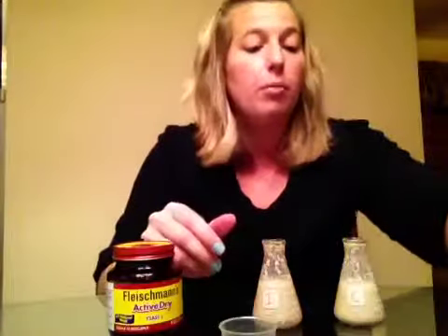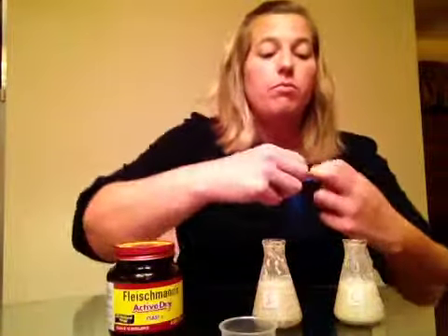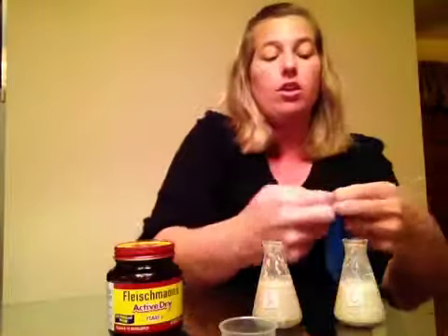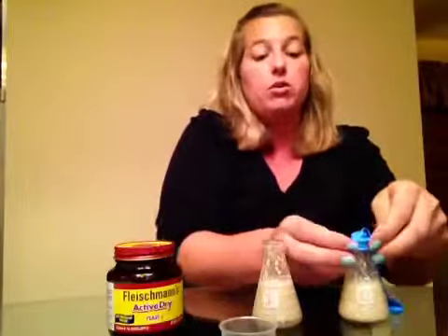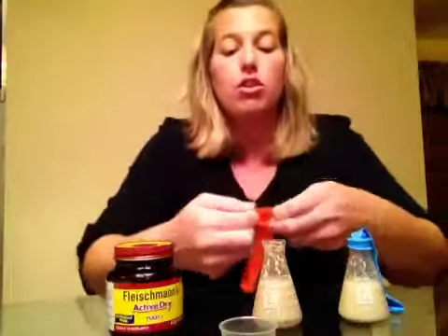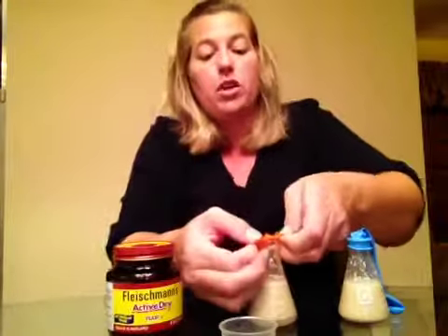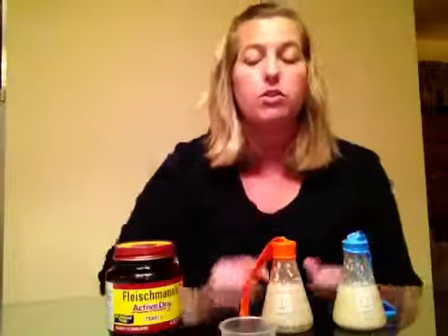And then I'm going to cap both off to not allow oxygen in. And you want to watch it because I had these, the one that's supposed to do cellular respiration, the one that's added sugar, they do explode sometimes. So it can take a few minutes to start, not too long.